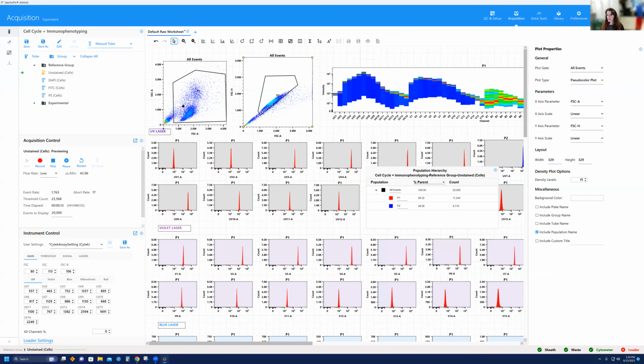What I want to do now is adjust this a bit so that I'm not seeing all this debris. Remember, we're on a full spectral instrument, and what winds up happening is every single event that you acquire is going to be stored, and you're going to have big data files because we have a lot of detectors here. I believe it's somewhere around 60-some odd detectors. Rui or Derek, please correct me if you know the exact number, but I'm just estimating there. So we just want to be mindful that we're not creating data files that are too big.